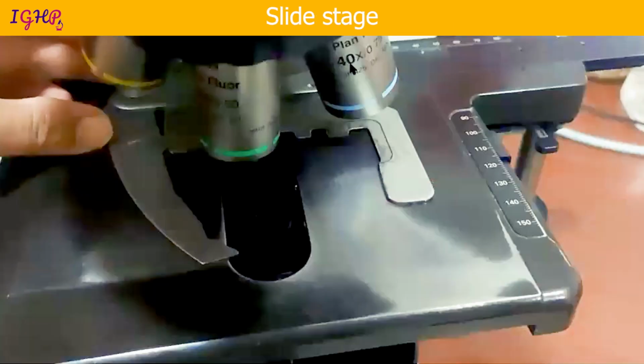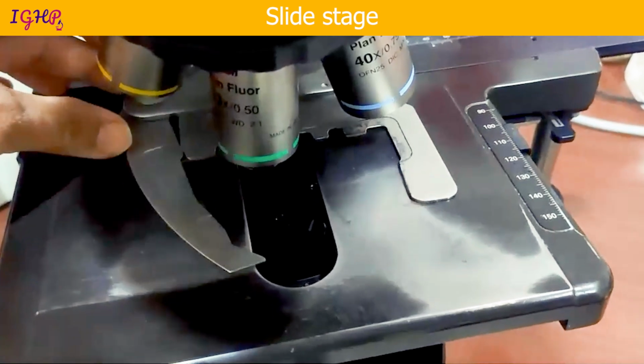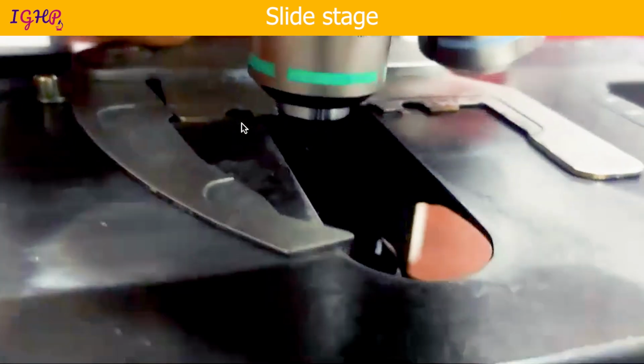The next thing that we have to see in the microscope is the slide stage, and at times the slide stage is loose, so that when you change your objectives your slide focus will be lost. So you need to tighten the slide stage with the help of the knob that is given on the stage.